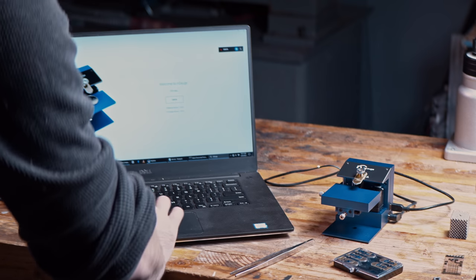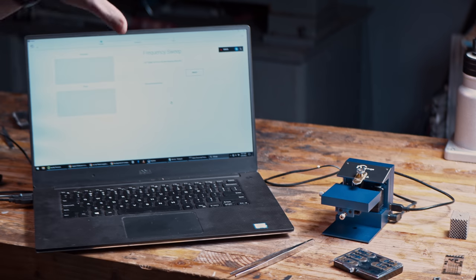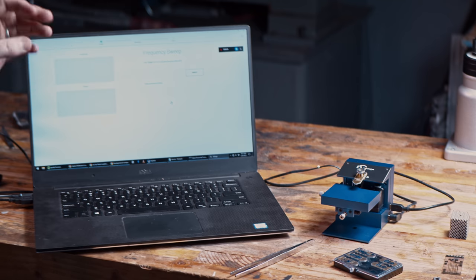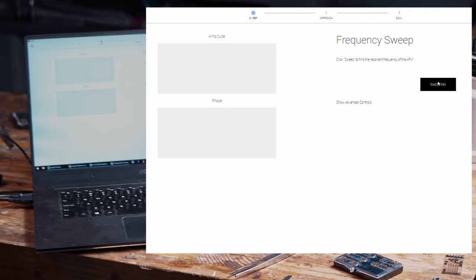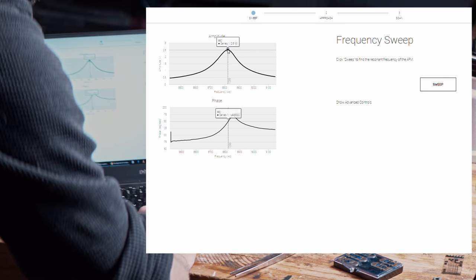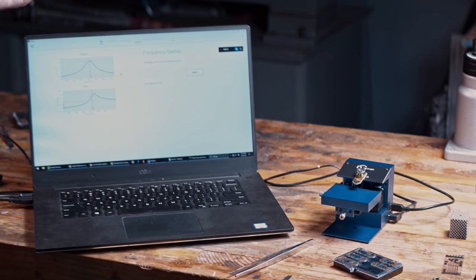At this point we need to enter the software and do a frequency sweep. Each cantilever has a specific frequency that it resonates at, and it's a little different based on manufacturing tolerances. The software will sweep through a range of frequencies to find the one it best resonates at. This particular cantilever is around 9,000 hertz, which is quite a bit higher than the 26 hertz that my macro AFM uses.